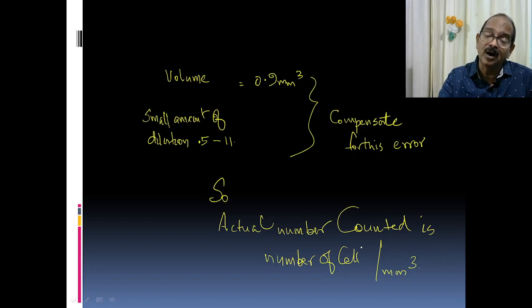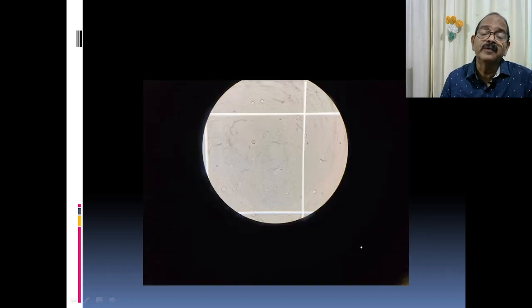After counting, you can verify the cells' nature under high power. This is one of the cells focused in high power. You can identify these as neutrophils. There is no nucleus here, just granular cytoplasm—the neutrophils have become pus cells. The nucleus disappears.